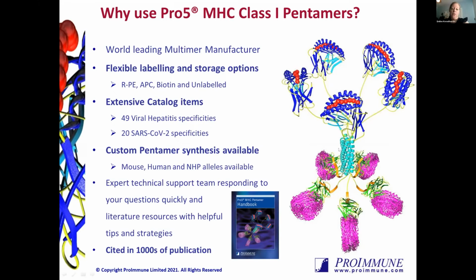So if you were using these, for example, in your clinical trial, then you can see the advantage in ordering a large bulk amount from a single batch to limit your batch to batch variation. Once you receive them, you can QC them and aliquot them and freeze them down and use them as needed, which would limit the amount of material you actually need to do the QC and gives you that bonus of long-term storage.